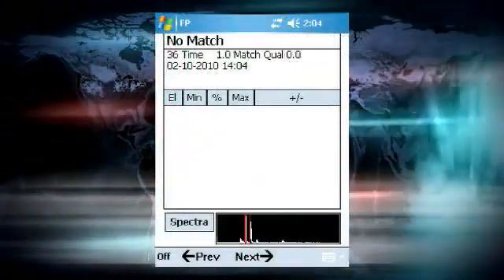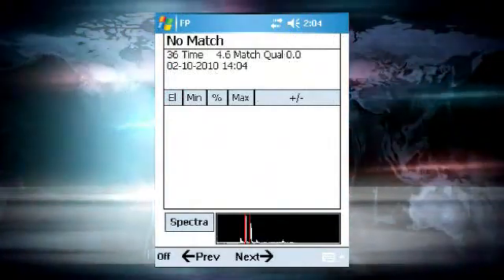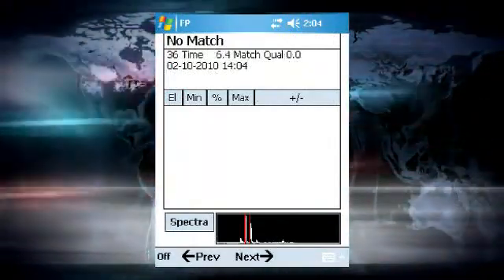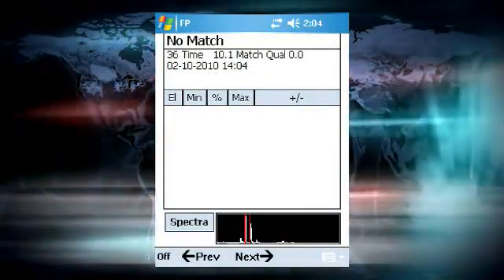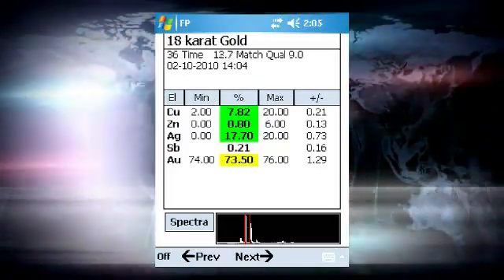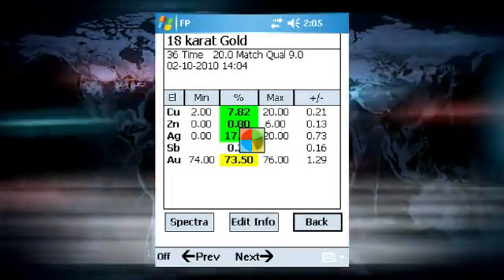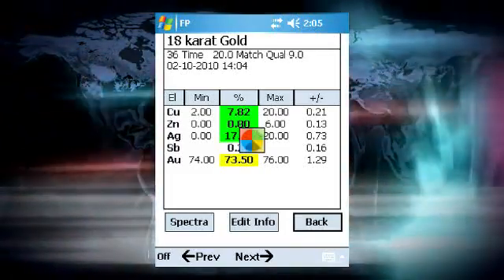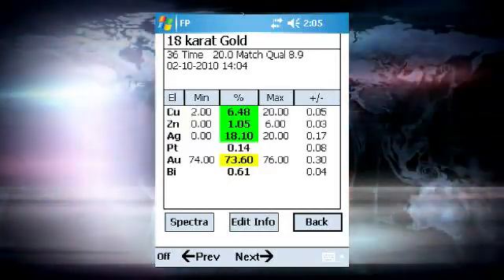When the fundamental parameters calculation is performed, there can be a substantial delay between the acquisition of the data and the presentation of the results. This is why the first results take some time to appear on the screen and also why the final results are not displayed immediately. In this case, the spinner icon appears indicating that the analyzer is busy calculating the results. Simply wait for the completion of the calculations and display of the data.